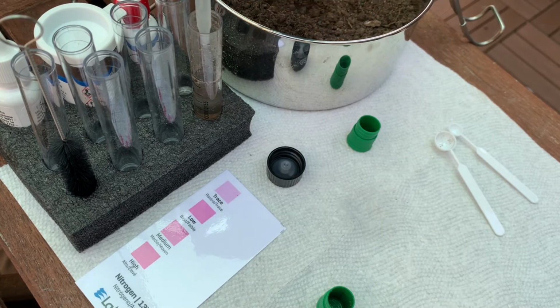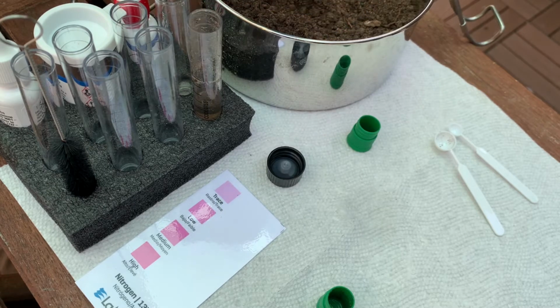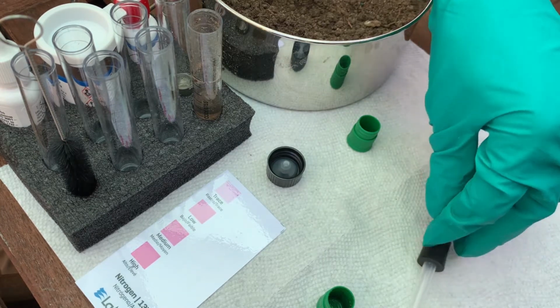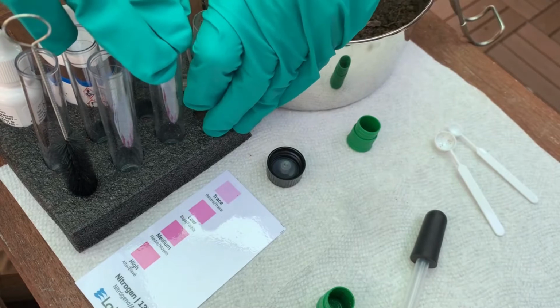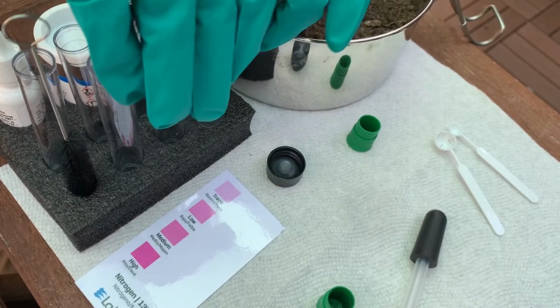And one way that will avoid stirring up the sediment is if you squeeze the bulb before you put it into the liquid. Release the bulb slowly to draw clear liquid into the pipette. Don't pull any soil up. You want to fill this to line 3 with liquid, which should be 3 droppers full.